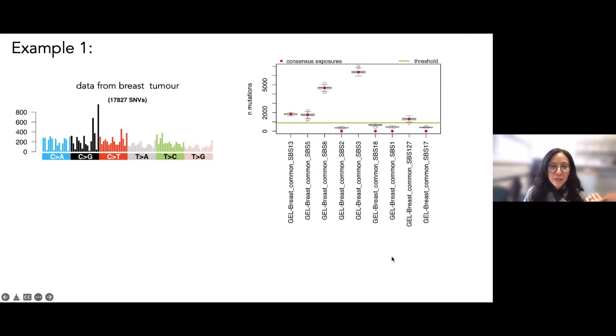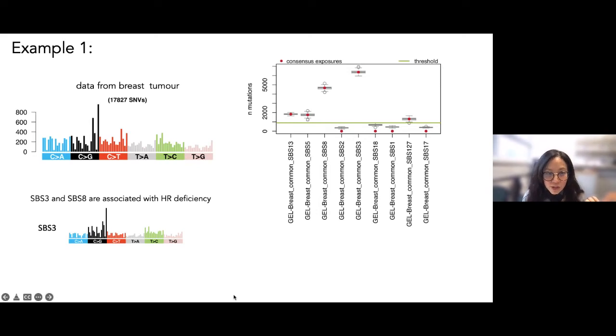Great. Okay. Is it within normal limits? Is this anything out of the ordinary? No, these are all the common signatures, and the sort of total values seem to be reasonable. Are there any clinically relevant signatures? And the answer is yes.